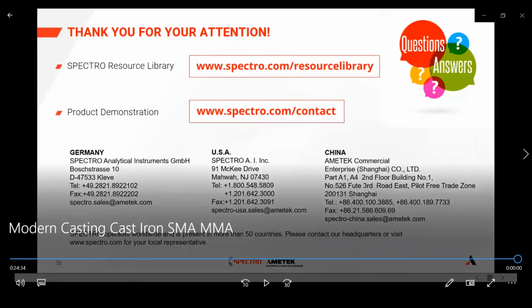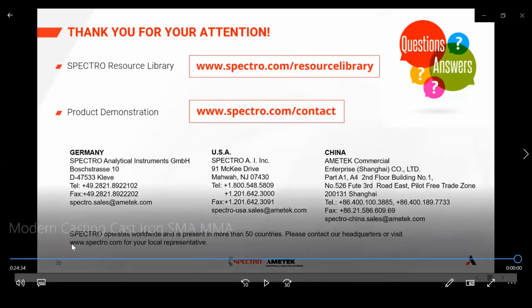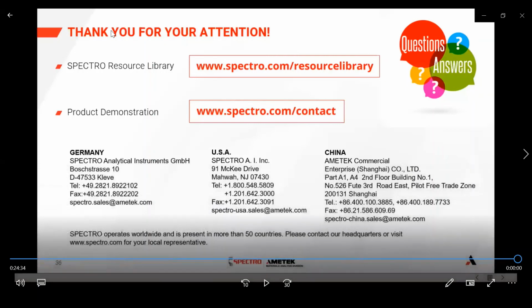One question I got was why can't it be used for finished parts or as cast? And this goes for heat treated samples as well. It can't be used for those kinds of samples, as-cast finished parts, because the carbon content is too high, and that is part of the problem. That's why we have such an emphasis on the sample preparation and sampling procedure to get a special sample as opposed to trying to analyze as-cast parts.